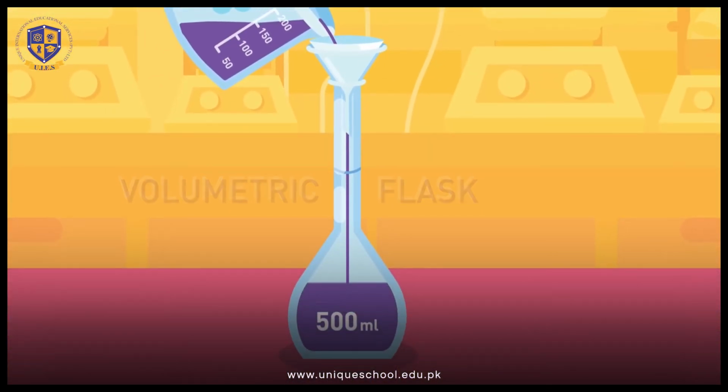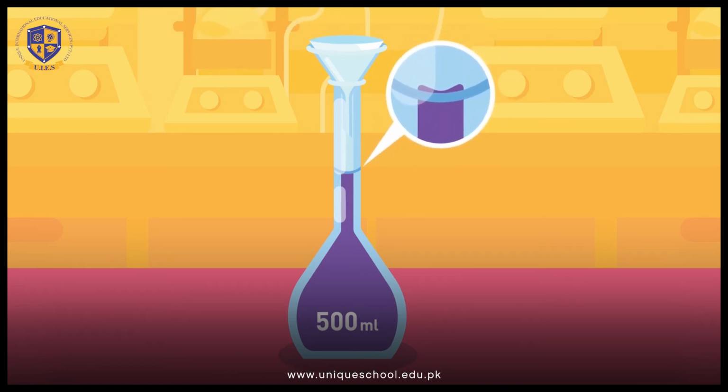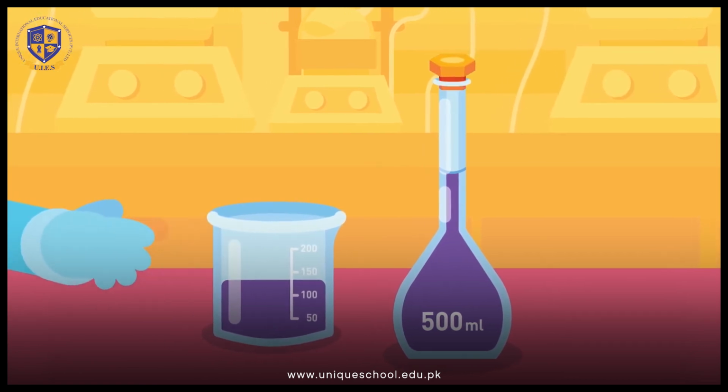Volumetric flask. A volumetric flask is a round flask with a long neck and a flat bottom. It is used to prepare solutions to an accurate volume. There is a small line on the neck that indicates how far to fill the bottle. They come with special caps to prevent contamination and leaks.